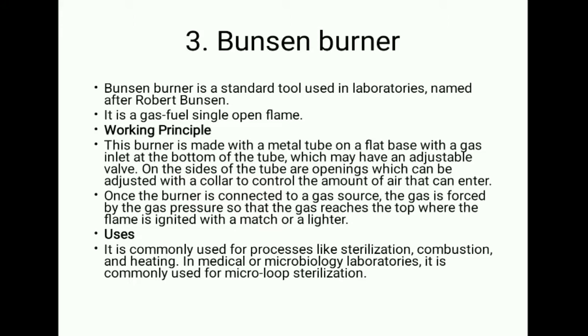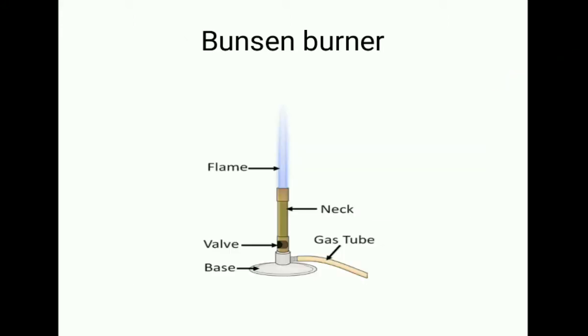Once the burner is connected to the gas source, the gas is forced by the gas pressure so that the gas reaches the top where the flame is ignited with a match or a lighter. Talking about use, it is commonly used for processes like sterilization, combustion, and heating. In medical or microbiology laboratory, it is commonly used for micro-loop sterilization. So this is a burner.